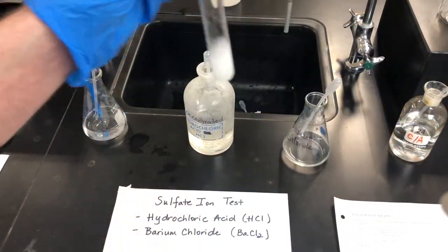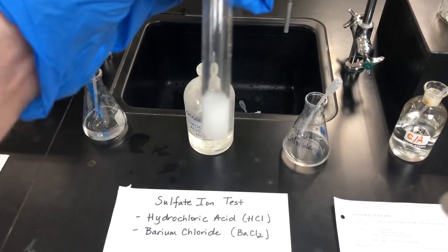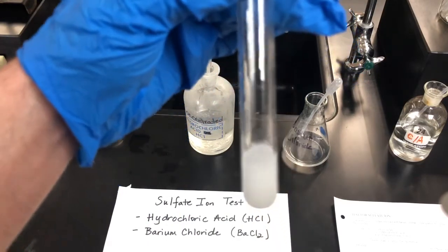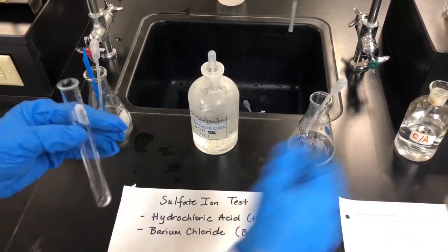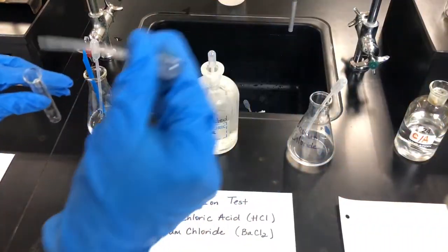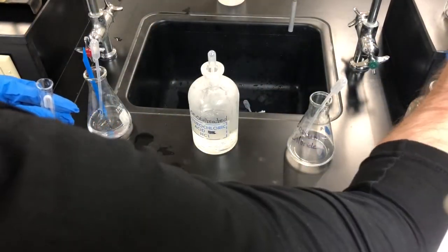And so like we did before, we get a white precipitate. Okay, that forms, it turns white. Now, we're going to come back and do our unknown with the sulfate ion. Okay, so we're going to have our unknown. We're still dealing with unknown number 24. So we're going to test it for the sulfate ion test. So it says we're going to put 1 to 2 milliliters of our unknown. So we'll do a nice squirt.